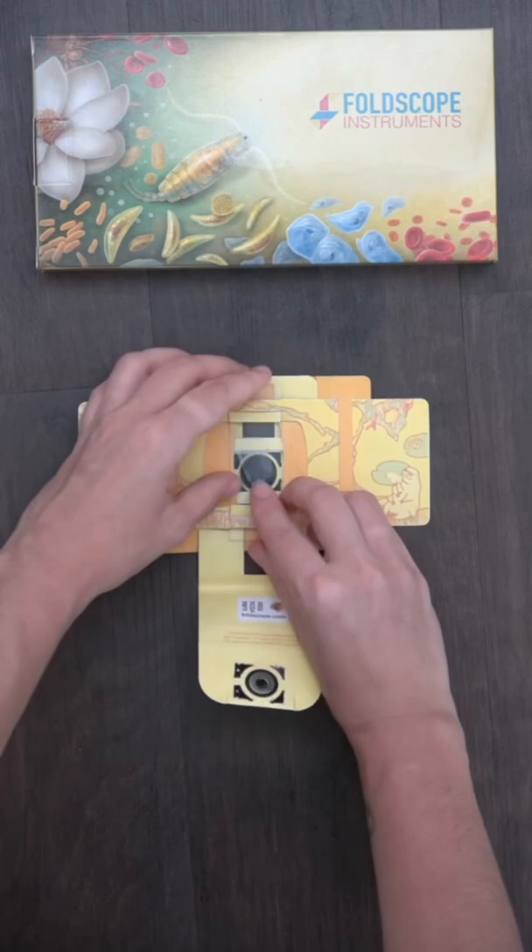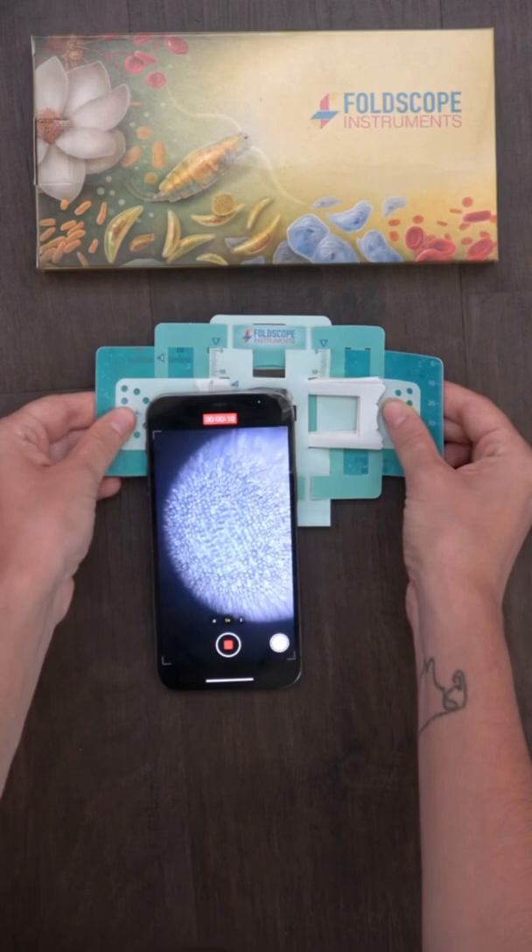Grab your Foldscope and put your sample in sample side down. Then get your LED light and your phone cup or tool and check out this beautiful sample.